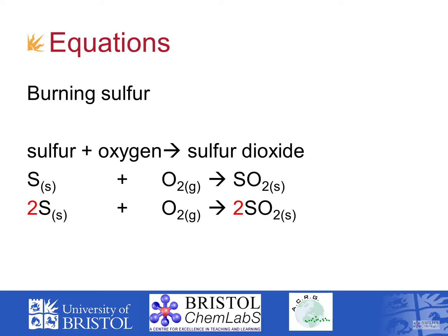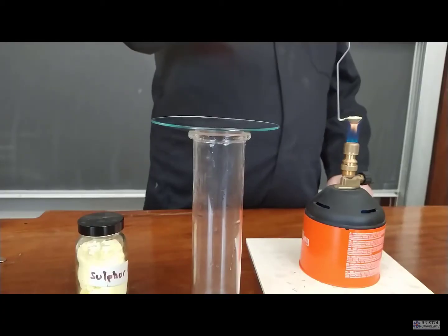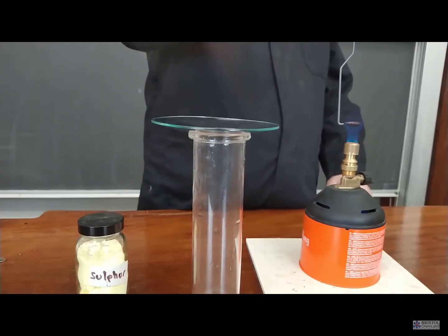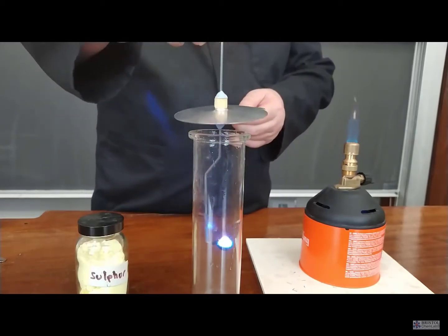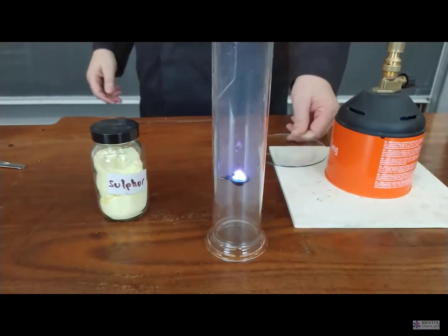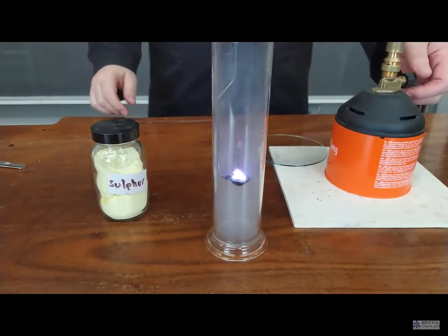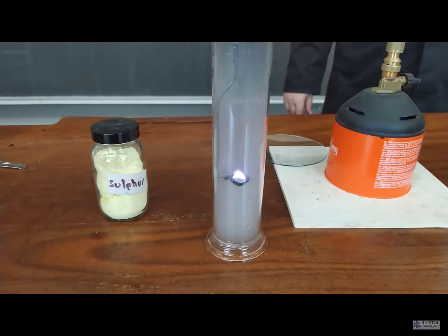If it's magnesium, I tend to use magnesium ribbon and just tie it in a loose knot around the end so that it drops down vertically. The problems you have with magnesium burning are twofold. One, the bright light that's given off, you're not supposed to look directly at it. That's a challenge when you have to put this stuff into the gas jar.